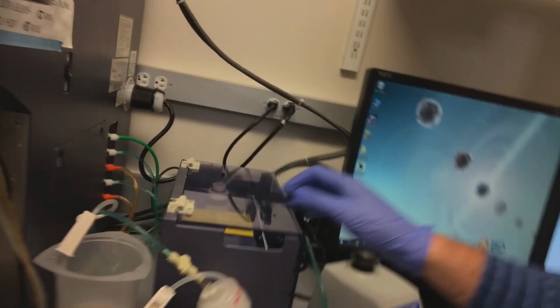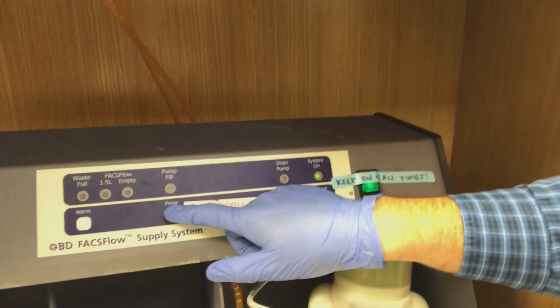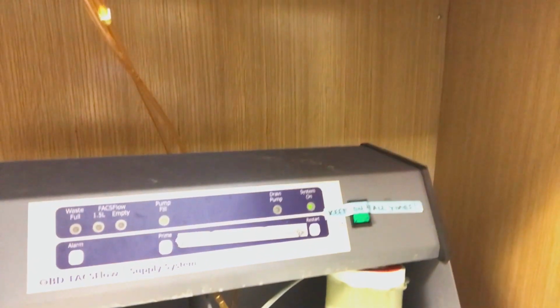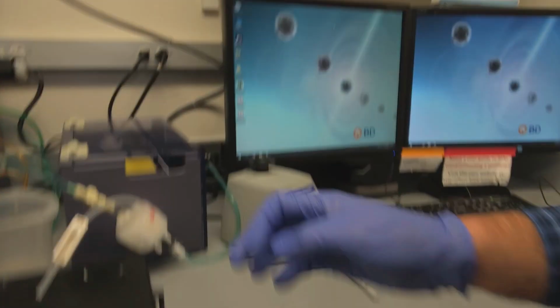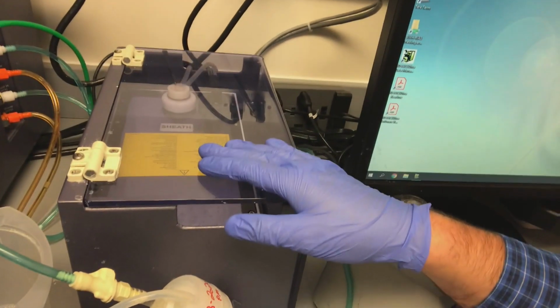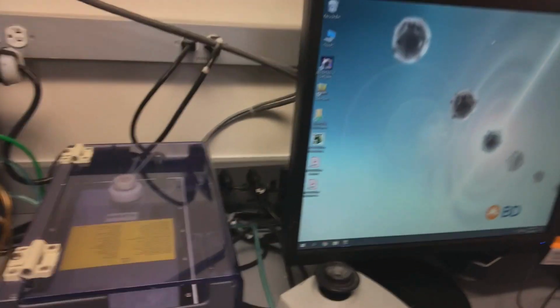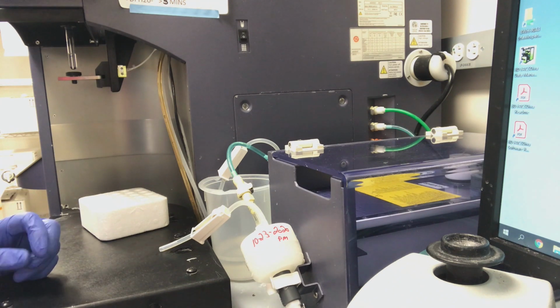At this stage, we've emptied our tank here, and you can see the pump will continue to fill from this sheath tank into our reservoir here, which is pressurized to run liquid through the machine at a constant pressure. Train your ear to listen for that pump to be activated while operating the cytometer.